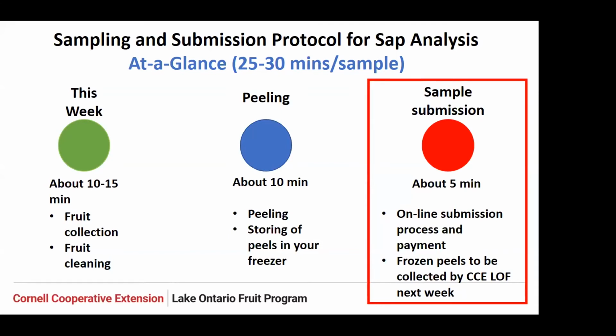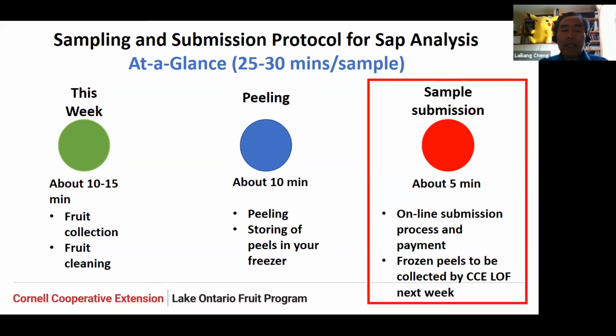I don't know, Lilian, what do you think? Do you think it's a good practice? I would prefer to get a few bottles of the purified water and wash them instead of using well water or any other type of water, because some of the water could have a lot of calcium in it. So I would suggest using only purified water. For 30 fruitlets, you can buy a big bottle and wash them and then wipe them. I think that would be the best.